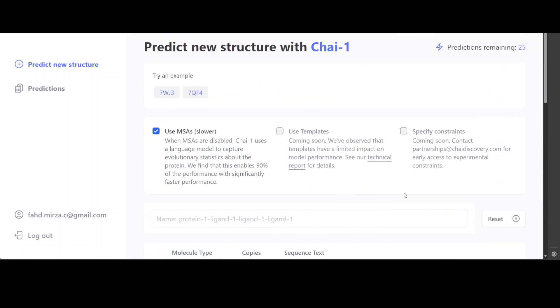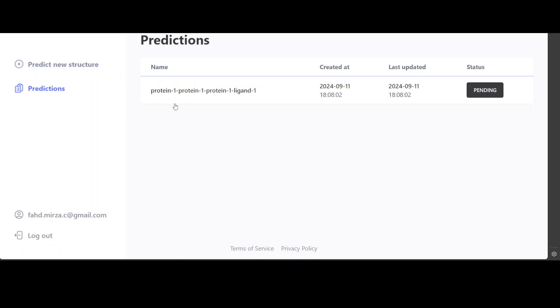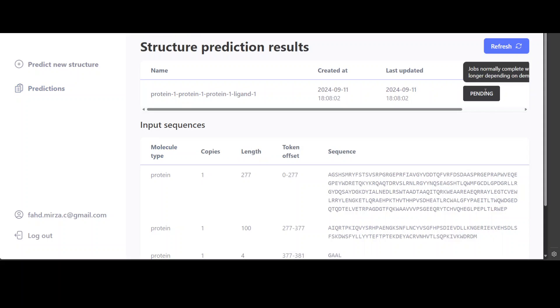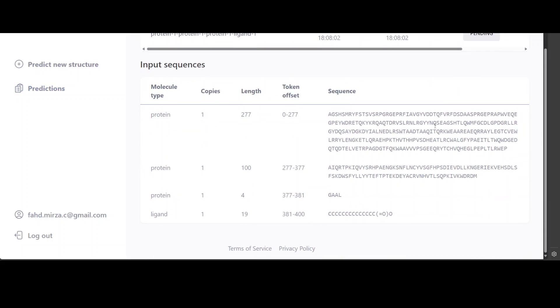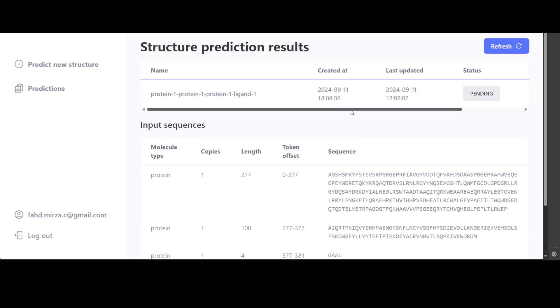And then it is going to show you here, as you can see, this is the one and these are the predictions. If you check out here, this job is still pending. You can click on it to see what is happening there.